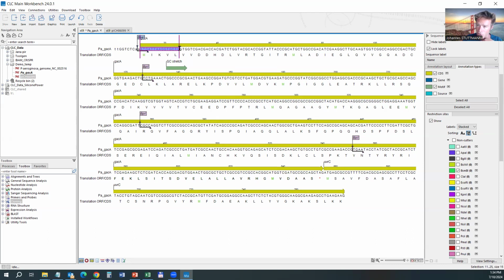So the only real variable is the length of the primer. I would make it something between 19 and 25, let's say, and depending on GC content, I will decide between these different lengths. Important is, of course, that the adapter doesn't contribute to hybridization. So the part that is really complementary to the PCR template has to be like these 18 to 25 or 19 to 25 nucleotides. Let's make it 19.